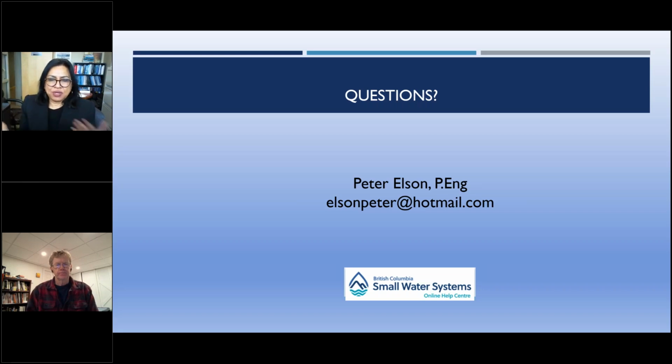Mostly we buy student grade equipment for our labs, and we have found over time that buying directly from Hach is the best rather than going through other providers, because they usually buy from Hach for you. So they're sort of the middle broker, and we found Hach to be more durable and so on. But that's for student grade, not in a treatment plant.